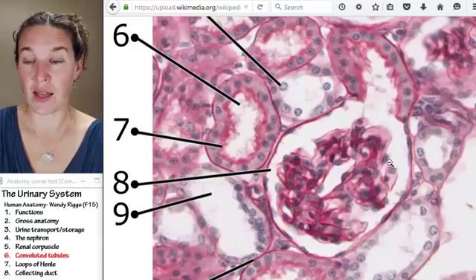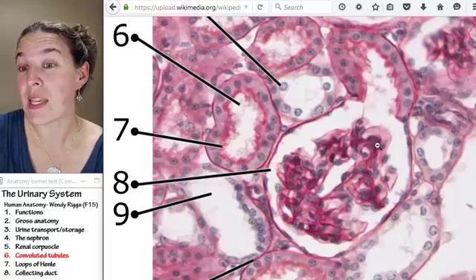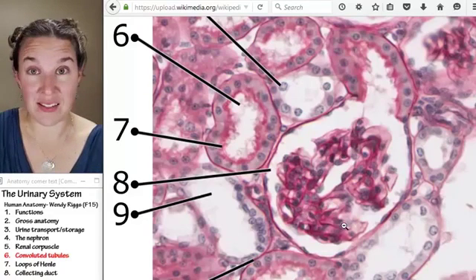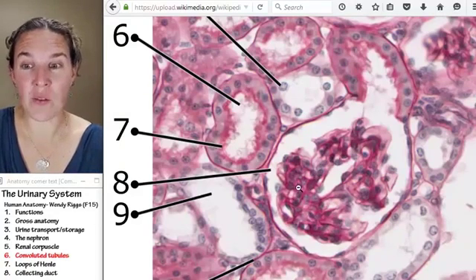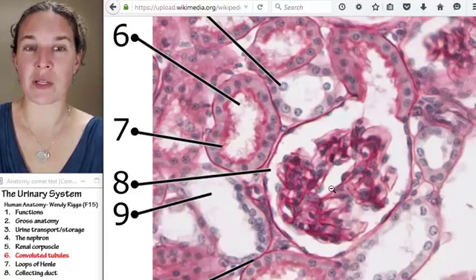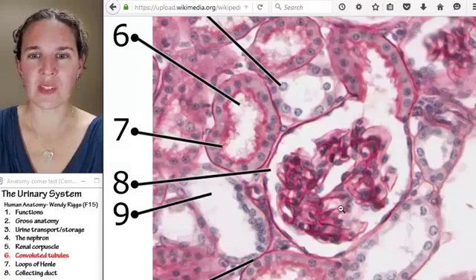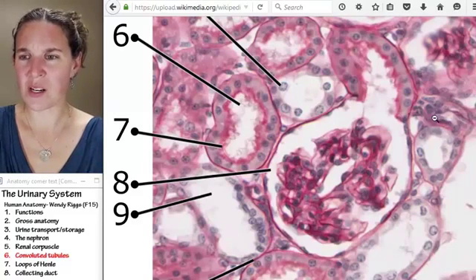Yeah, no. That looks like a mess of messiness. What I know is that there are podocytes there, and I know that there's blood vessels, capillaries there, and there's no way on the planet that I can tell the difference. Maybe somebody can. Holy tubes. Look at all these tubes.